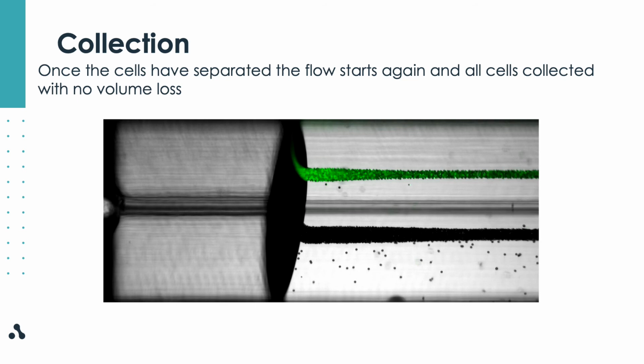So the sample has now been levitated and is ready for collection. The user has full control over which fraction they choose to isolate. Basically, there's a line they can move up and down. And let's say we would like to do a perfect 50 split between top and bottom. By selecting the middle level and clicking collect, the sample will then be sucked in or pulled through and collected into the separate 2 chambers we described before.